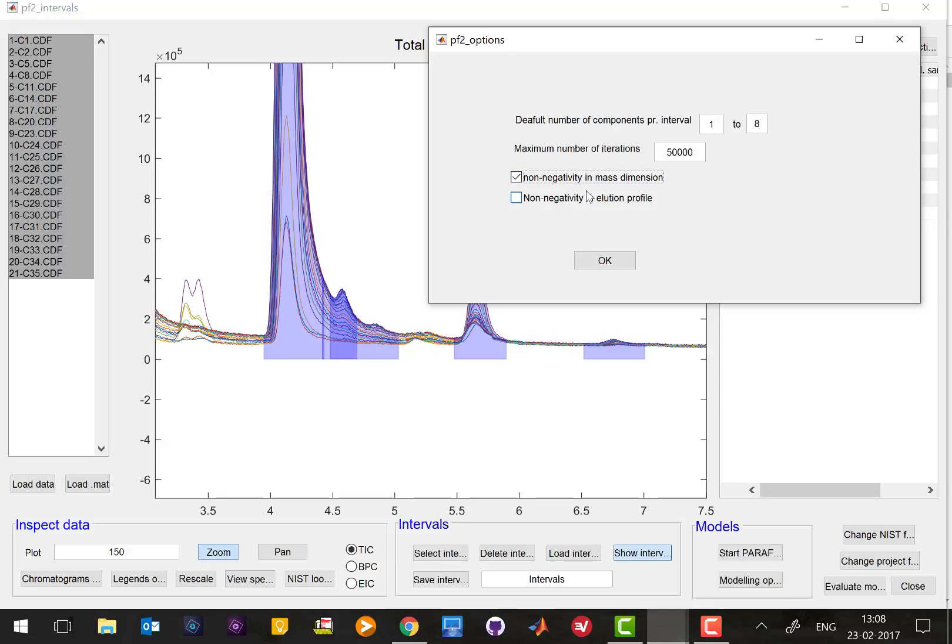And that simply means that when it tries to estimate the mass spectra it will try to estimate them in a non-negative manner. The other one we should not set, that's important for technical reasons that we're not going to talk about here.